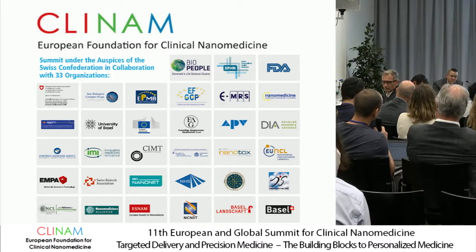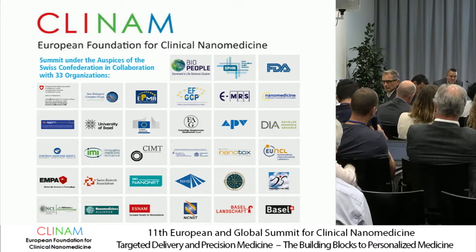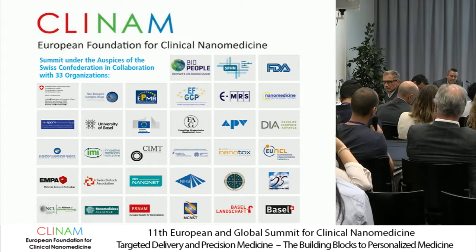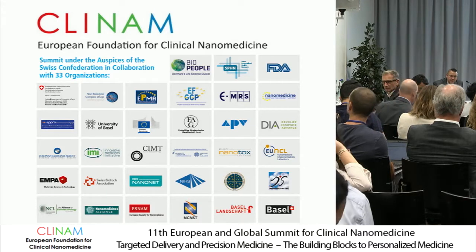And so far we have relatively good results, but it's an ongoing project. We just look at how the biological media behaves and how it changes as soon as we add nanoparticles. Could this be interesting for highly complex nanoparticles as you're using them?